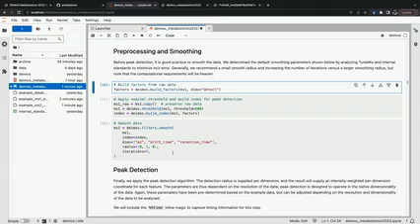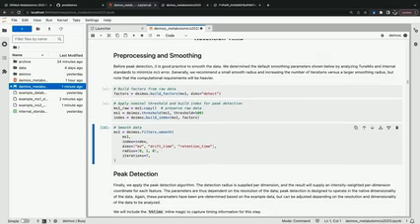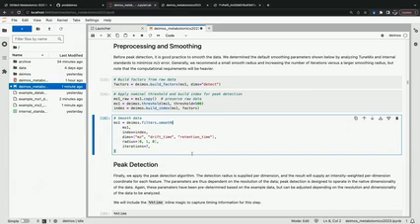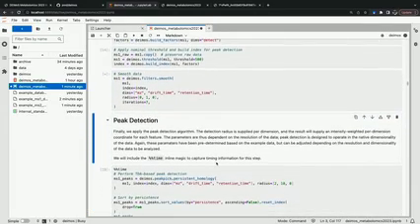And so we do that. We build our factors from the raw data. We apply a nominal threshold, just because this is a very large piece of data, so we're applying a very small intensity threshold of 500 to reduce that a little bit for the future steps, and then we'll apply the smoothing to smooth the MS1 data.